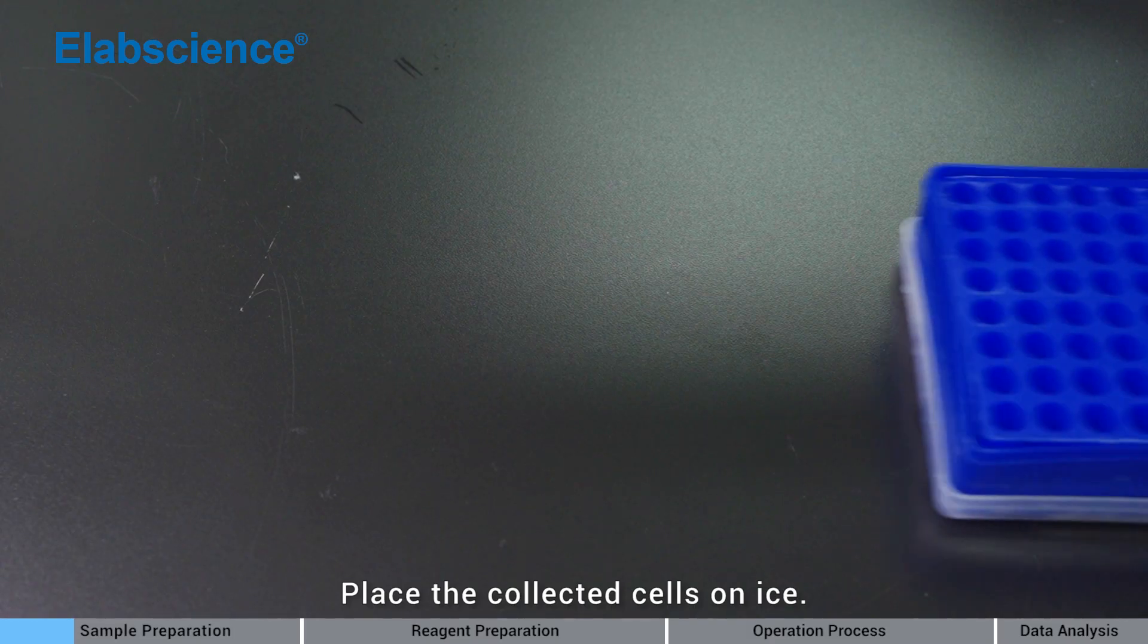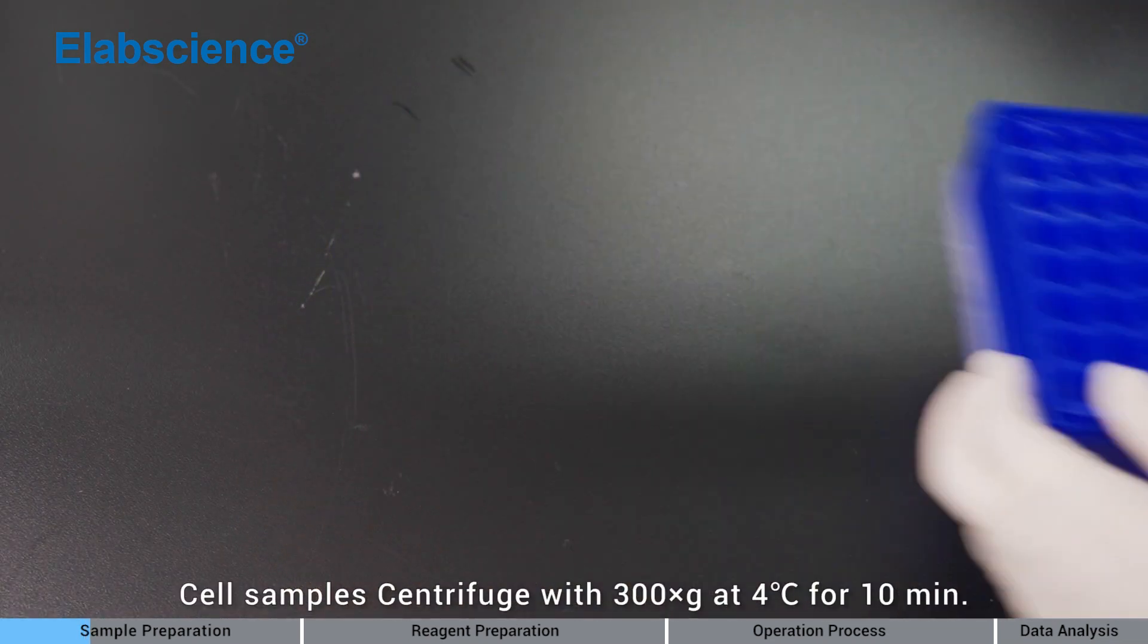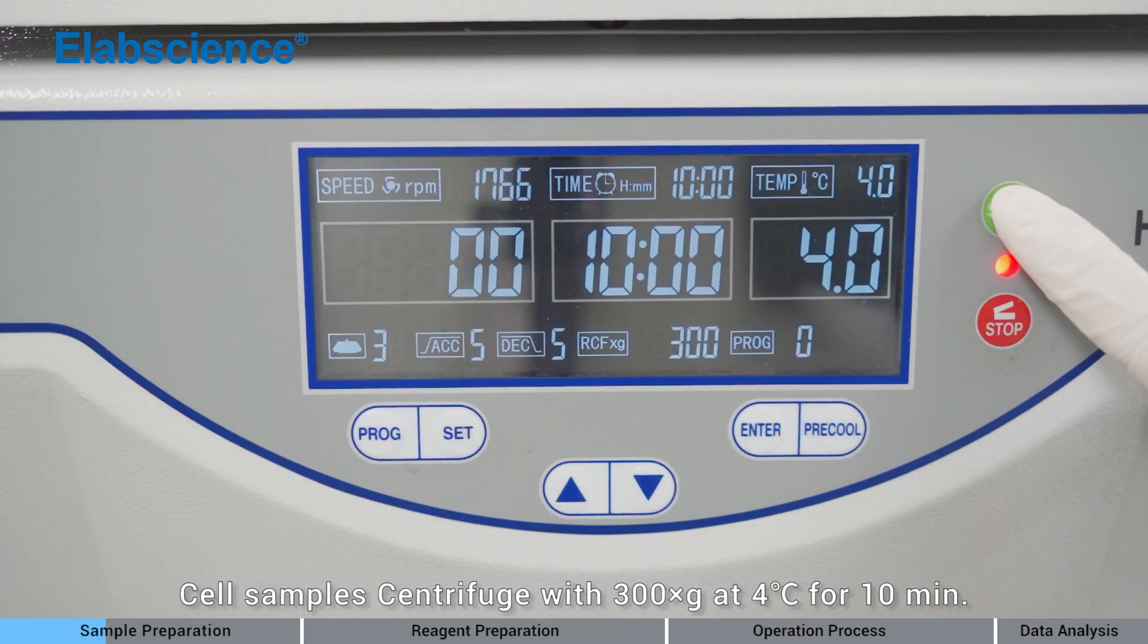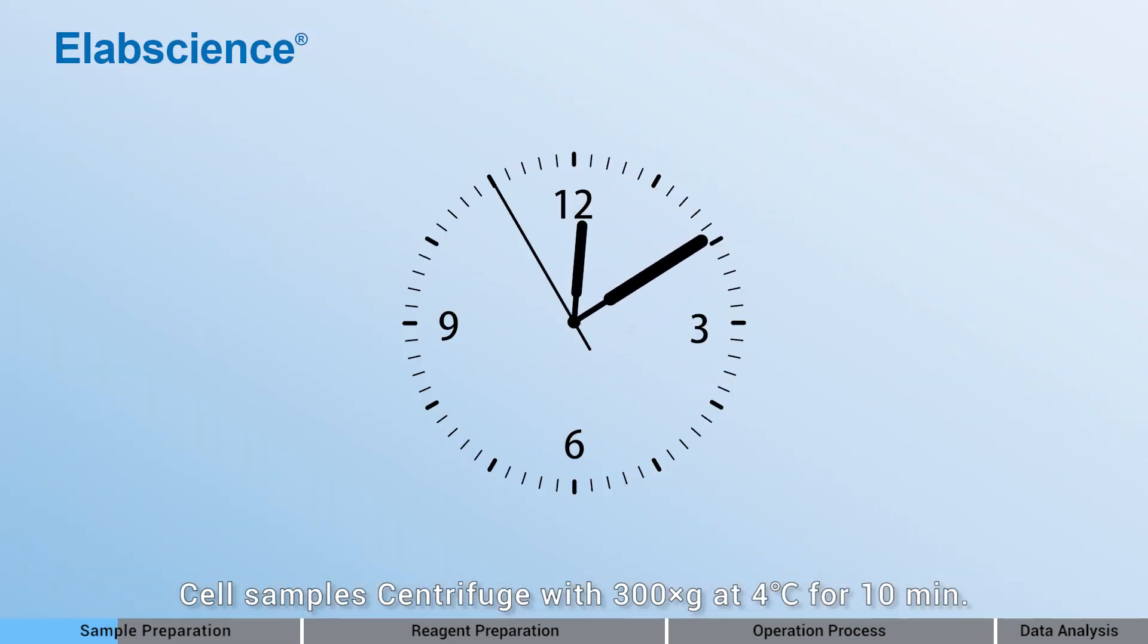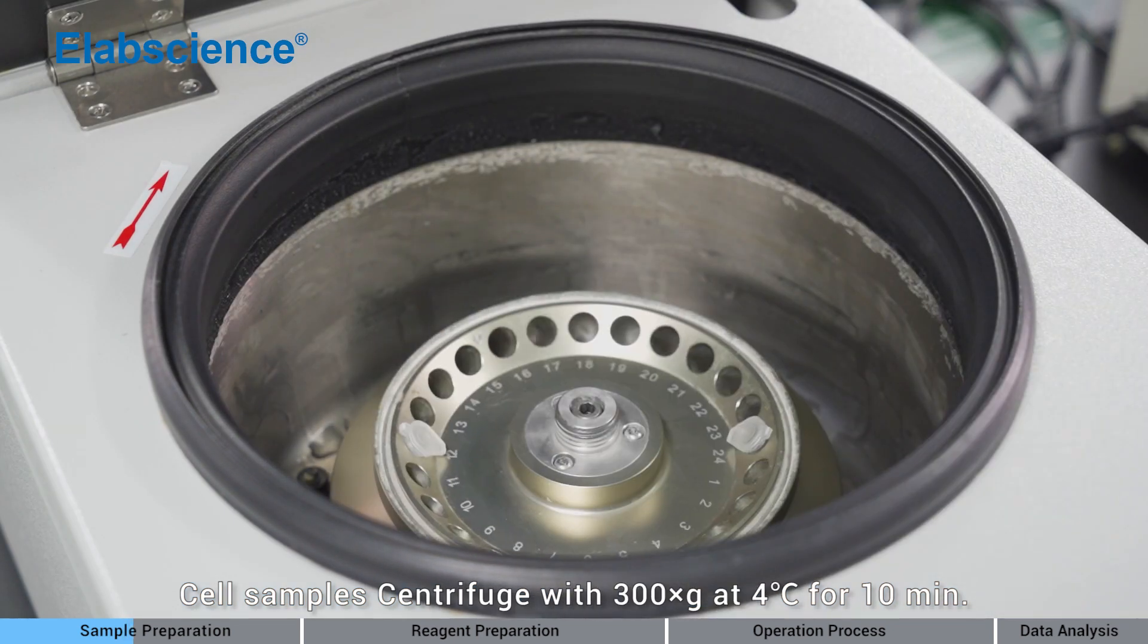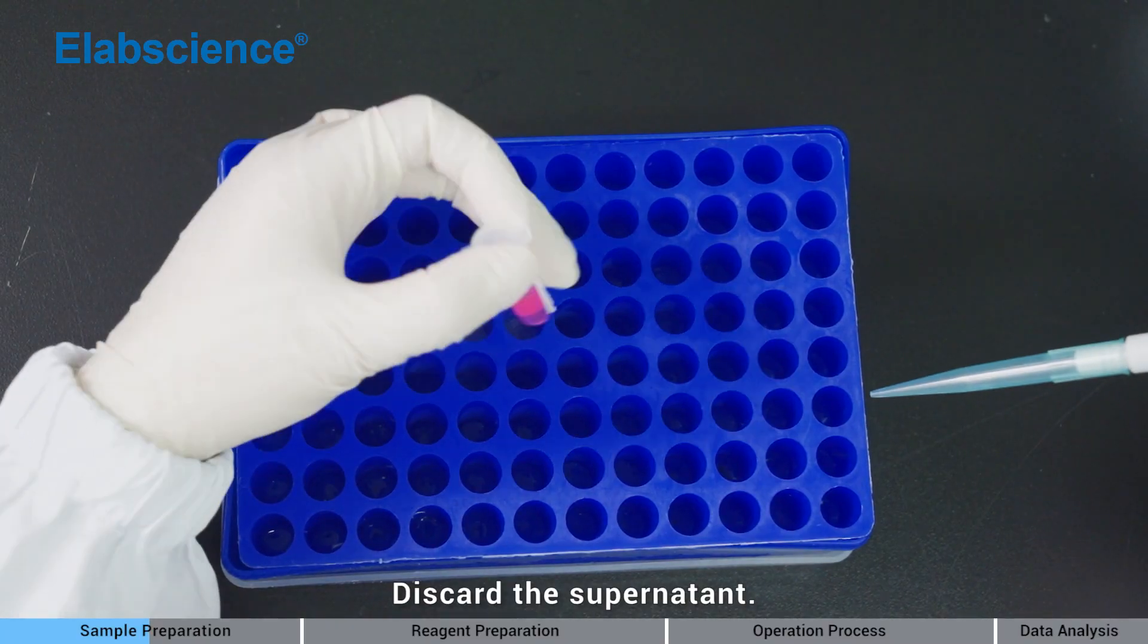Sample preparation: Place the collected sample to analyze. Centrifuge cell samples with 300 times gravity at 4 degrees for 10 minutes. Discard the supernatant.